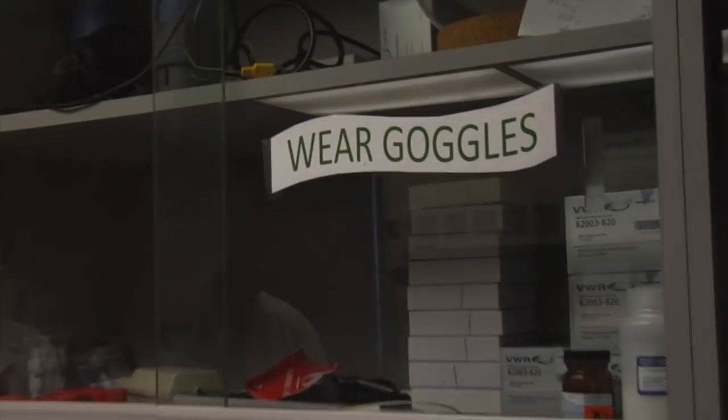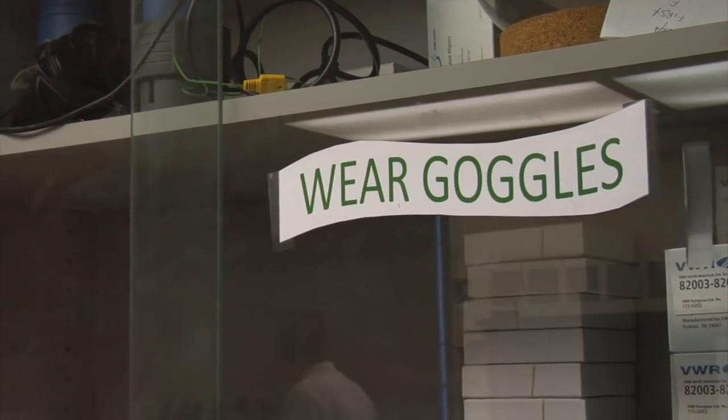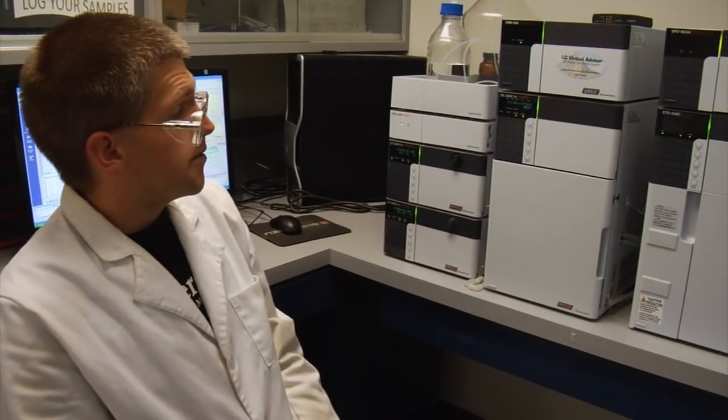If you eat fresh, raw cannabis, you will not get any psychoactive effects. It might still have some other medicinal benefits, but you will not get the psychoactivity that is caused by THC. This is our liquid chromatograph.